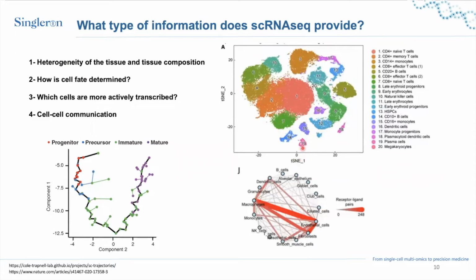Normally, single cell sequencing data is multi-dimensional data. And here, what we do is we reduce these dimensions into 2, namely t-SNE1 and t-SNE2. So based on only 2, we classify the cells based on their similarity. That means the cells in the same cluster are similar to each other and different from the other ones. Here you can see this is bone marrow cells, and they are clustered into 20 different cell types.